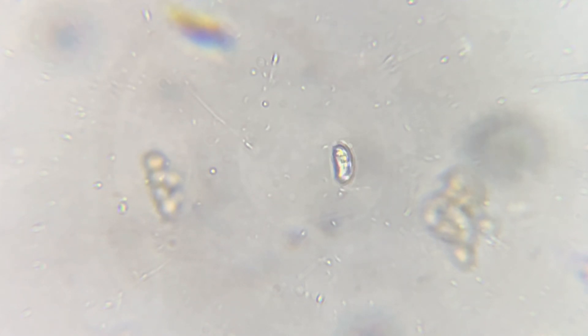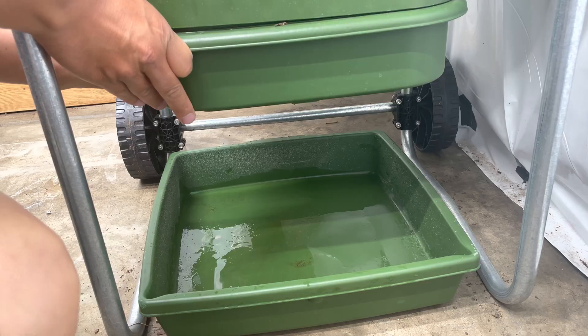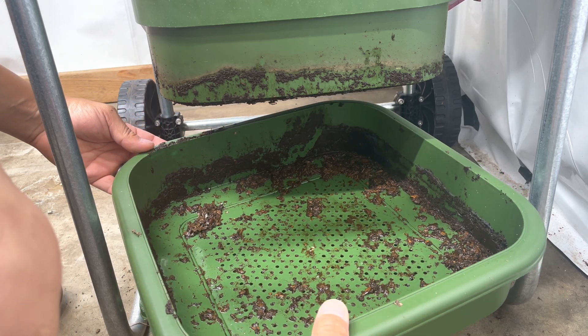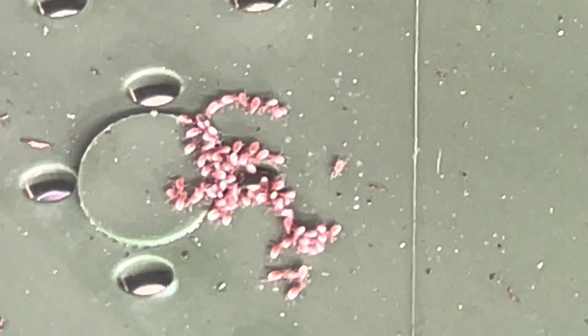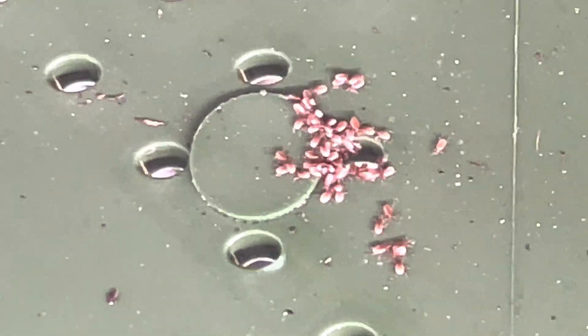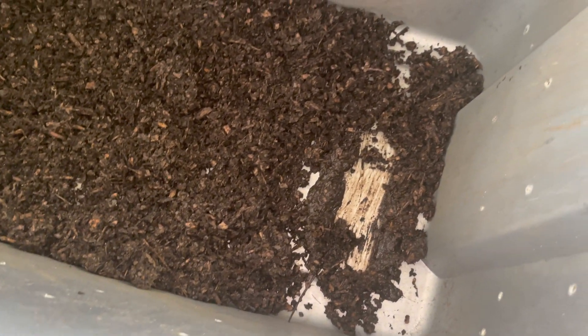You see some spirally strands of cellulose here. What I'm seeing appears to be anaerobic, so let's figure out why. After closer inspection and taking off the bottom of our composter, I found that the bottom grate had all kinds of worms and compost stuck inside it, which was not allowing water to drain — there you can see the clog. I also found some really cool predator mites in the lid of our compost bin. At this point I decided to clean out that bottom filter, took the big clump stuck at the bottom, and spread it out in a Tupperware bin. That will allow oxygen to dry out most of the material and let it go aerobic again.